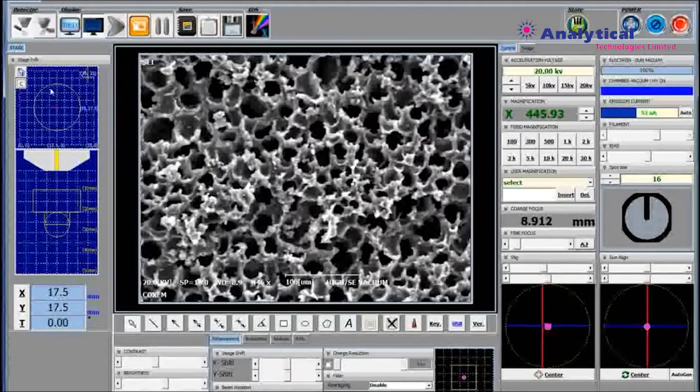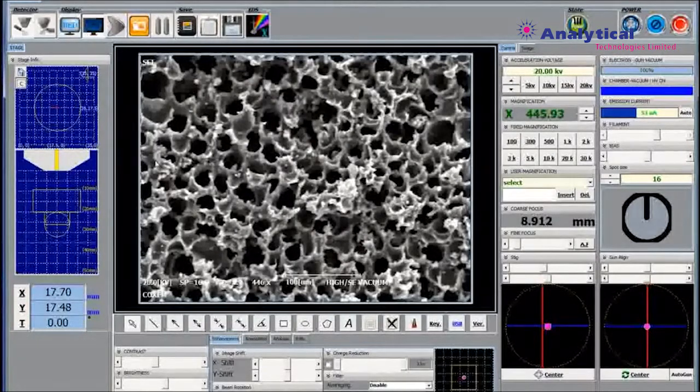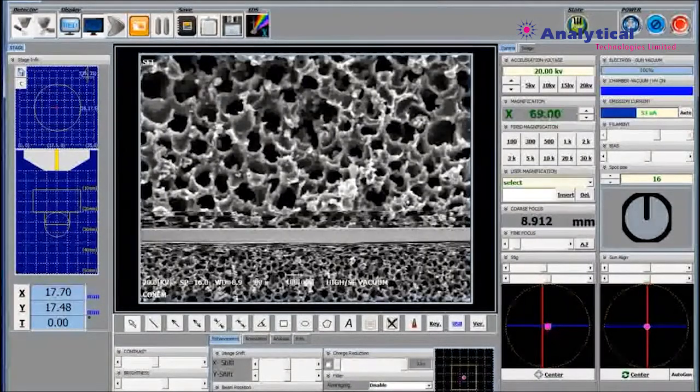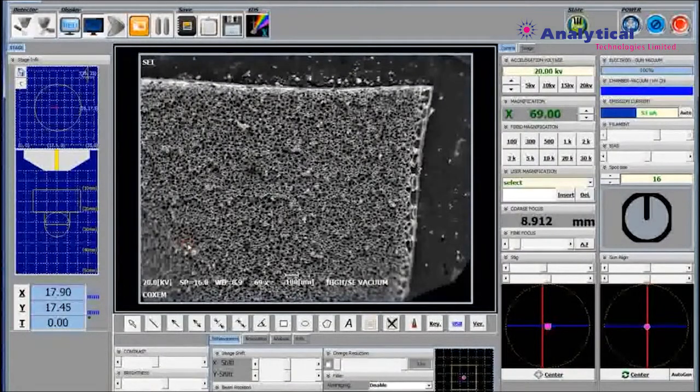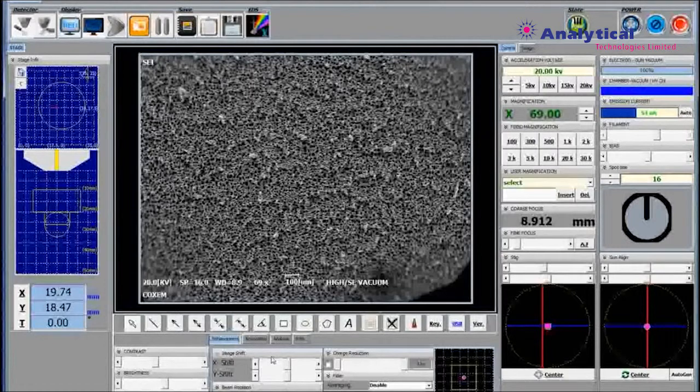After relocation is complete, move it to the position desired by double click. One precaution is that in an enlarged state, it's difficult to tell the position and the shifting time is longer. So, scale it down. After locating it to the position desired, put the cursor on top of magnification and magnify it with a wheel.